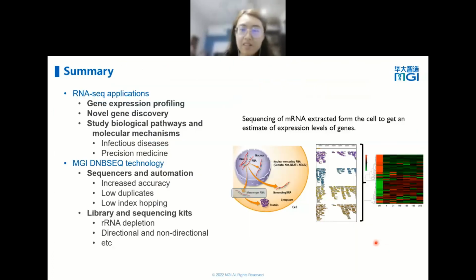So basically, this is the end of my talk. Today we went through a little bit on the RNA-seq applications, gene expression profiling being the most commonly used application for RNA-seq. Secondly, from this profiling, we can also discover novel genes. And of course, all of this is used to study biological pathways and molecular mechanisms.